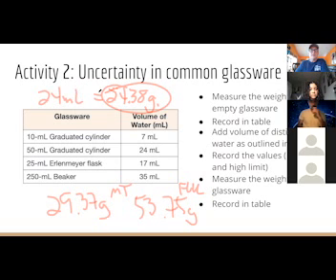Okay. So use the cylinder to fill up the flask and beaker. Ah, yes, don't do that. If you've measured out precisely 35 mils in the cylinder and then poured it into the beaker, that wasn't the point of the exercise. Because basically what you're doing is using the cylinder to do the measuring. We want to actually use the beaker to do the measuring.